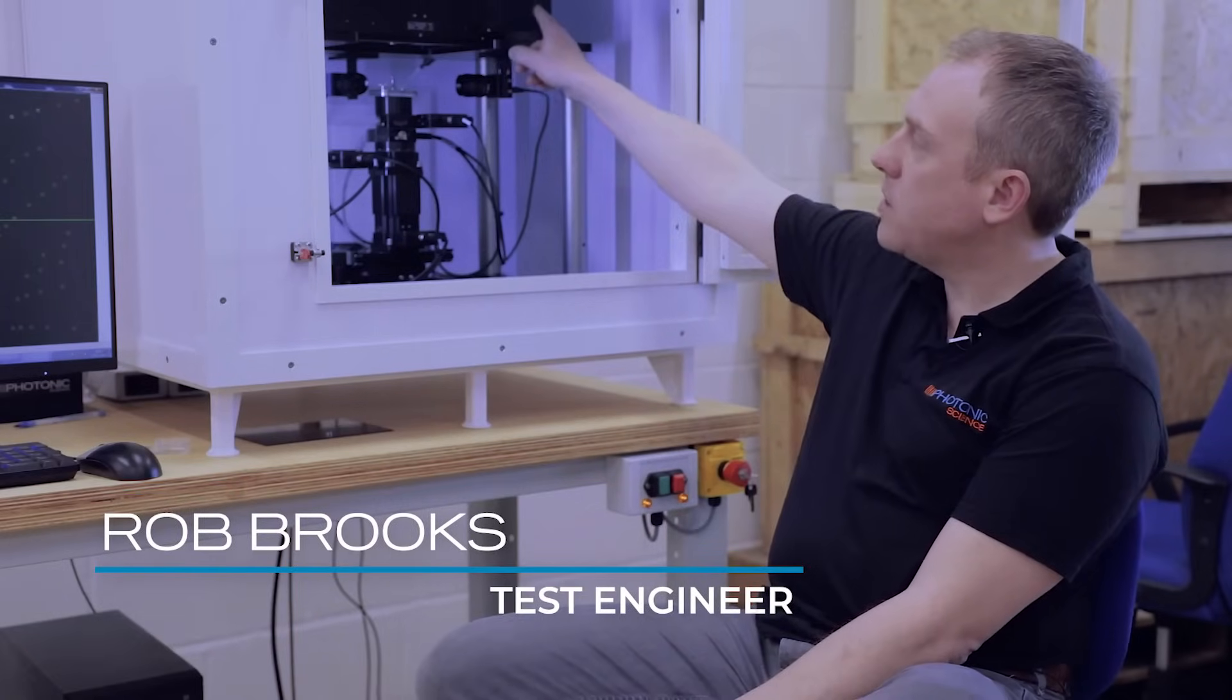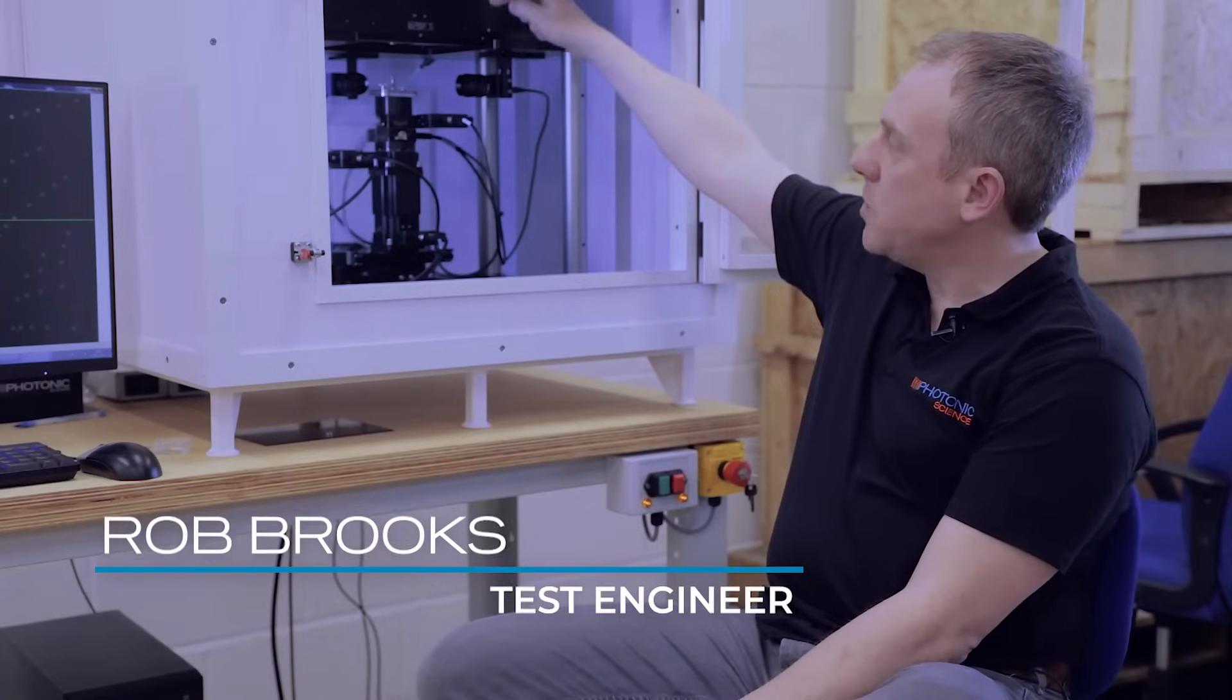This is a Lowey diffraction system. The main features are we have a Lowey camera sitting up here which is facing downwards.